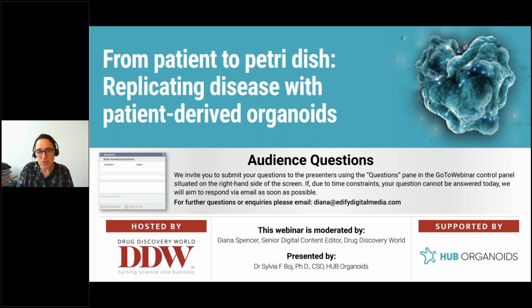The comparison about the co-cultures, I'm not sure if I'm going to understand the right perspective. If not, this person can make a comment. If the co-cultures means, I don't know exactly what it means, but I will assume that it's about not primary cells, but tissues, so you get a biopsy of a patient where you don't only have the organ or the tumor cells, but also other cell types like immune cells or fibroblasts or endothelial cells that are present there.